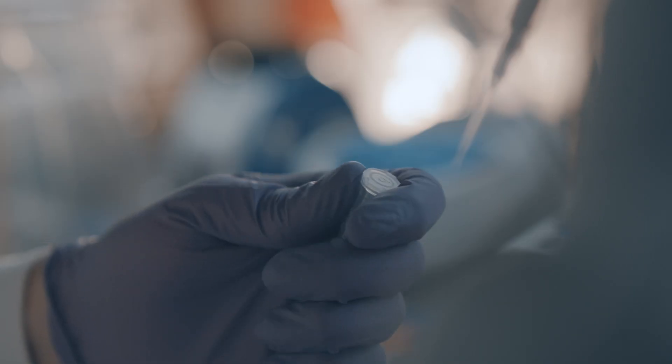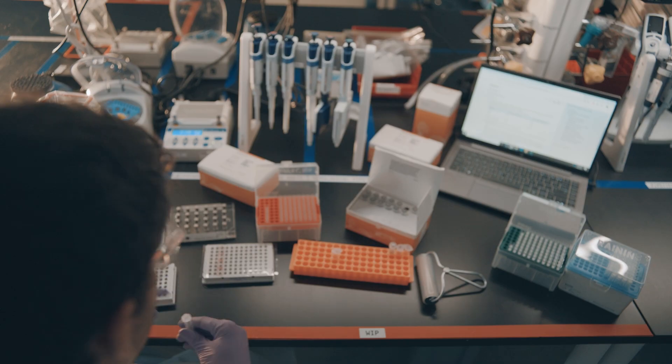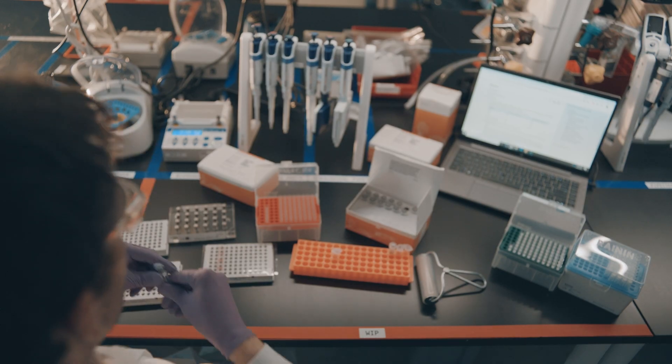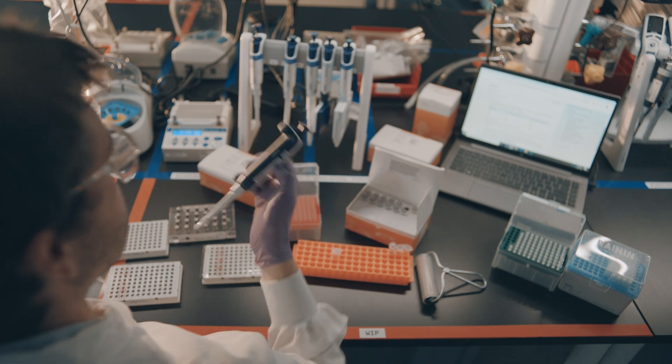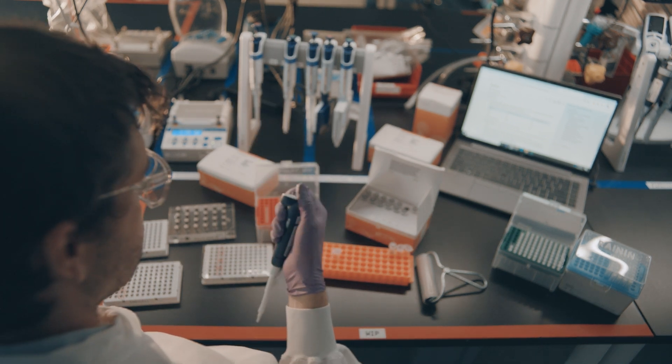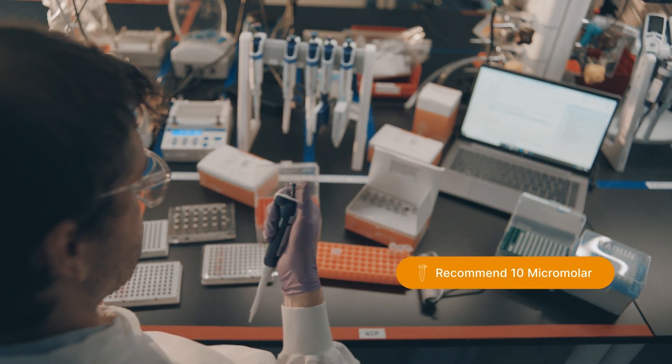Once primers are designed using Primal Scheme, they can be ordered from a third party such as IDT. After primers are received, the user can pool them together and dilute to working concentration, which we recommend as a default to be 10 micromolar.